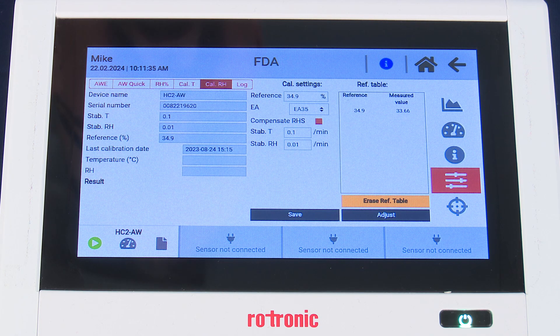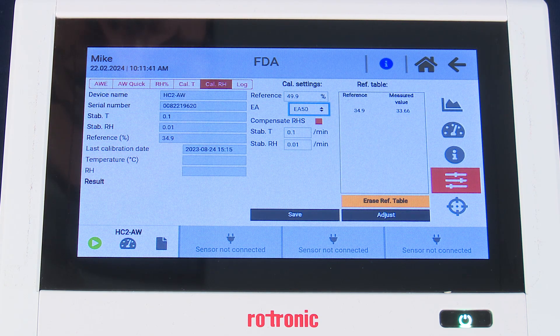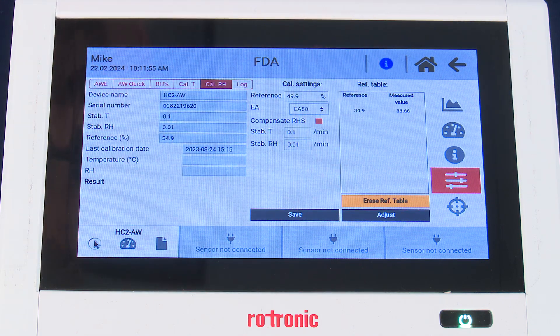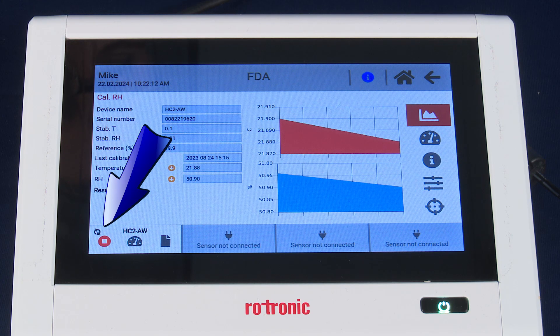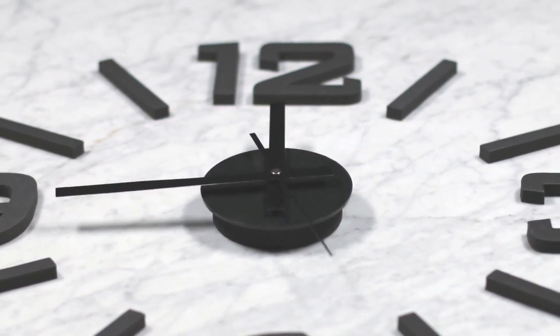Make the change on the screen under the CAL settings drop-down menu — we will move to 50%. Verify that temperature stability and RH stability are at 0.1 and 0.01 respectively. Once we've made these selections, we want to save. The green bar at the top indicates we've successfully saved these settings. We're going to start a new measurement by pressing the green start button in the lower left-hand corner. The two spinning arrows indicate that we are now in measurement mode, and again this could take 30 to 60 minutes.